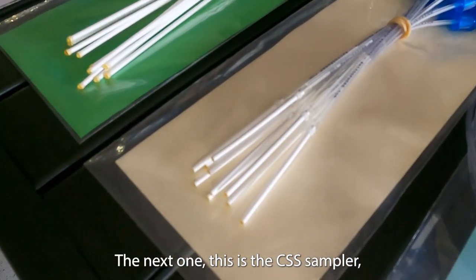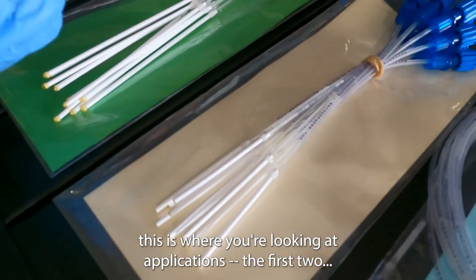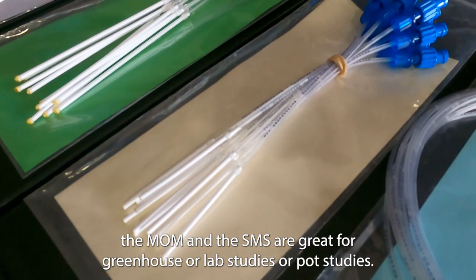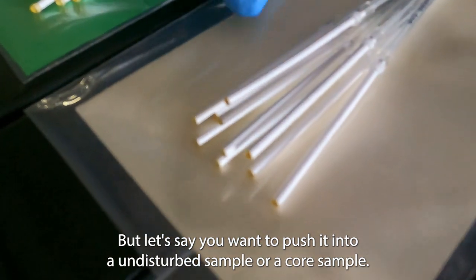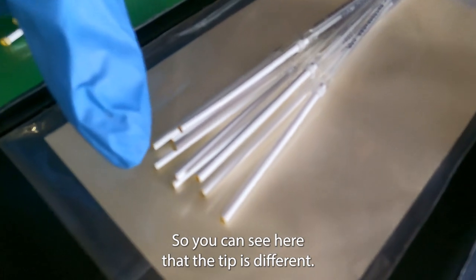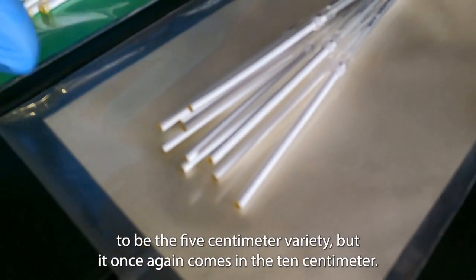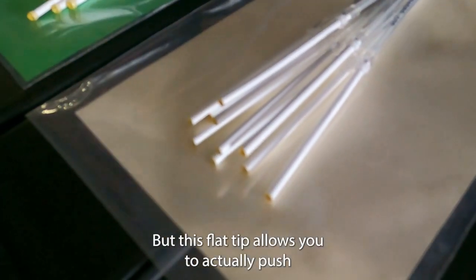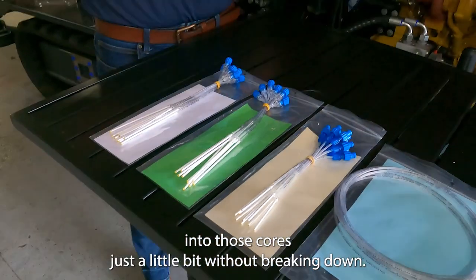The next one is the CSS sampler. The MOM and SMS are great for greenhouse, lab, or pot studies, but if you want to push a rhizon into an undisturbed sample or a core sample, that's where this one comes in. You can see the tip is different — this happens to be the 5 centimeter variety but it comes in 10 centimeter as well. This flat tip allows you to actually push into those cores without breaking down.